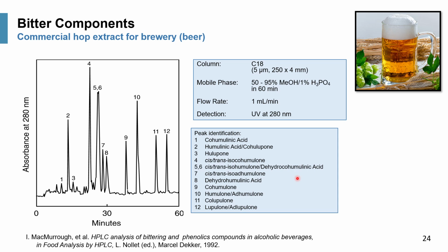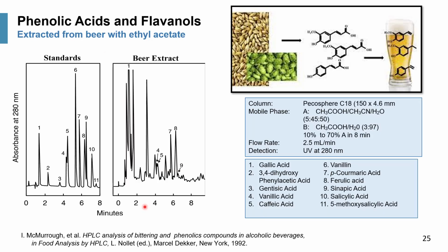The bitter components, such as the commercial hop extracts, are shown here in an application. Next are also some flavonols and phenolic acids extracted from beers.